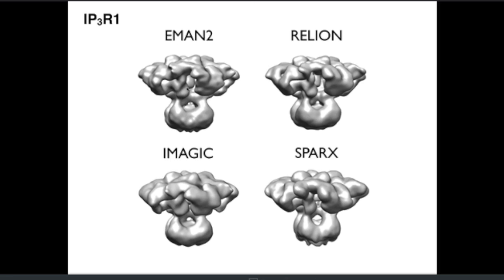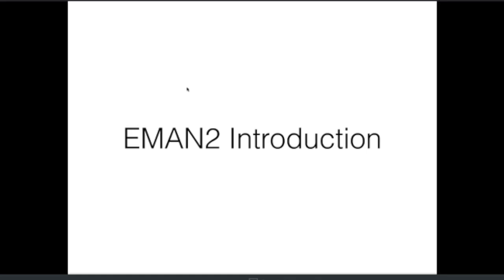All right, so that's my general introduction to cryo-EM in 10 minutes. Now let me give you a little bit of background into EMAN, and I'll do that for probably 15 or 20 minutes, and then I'll do some live demos, and we'll take a look at how the software can be used.